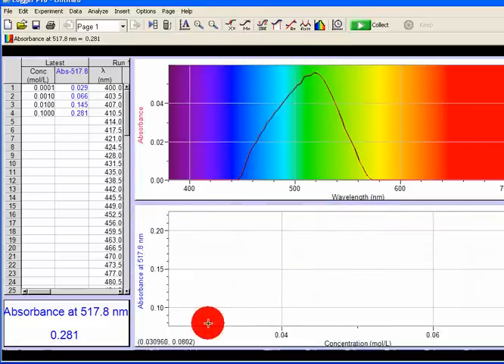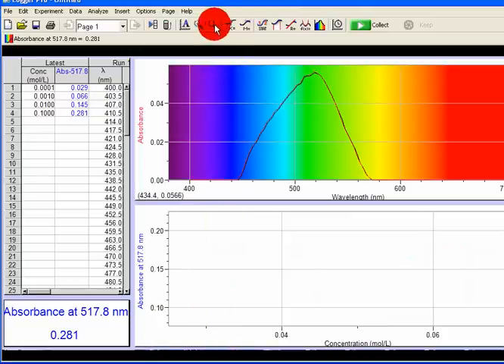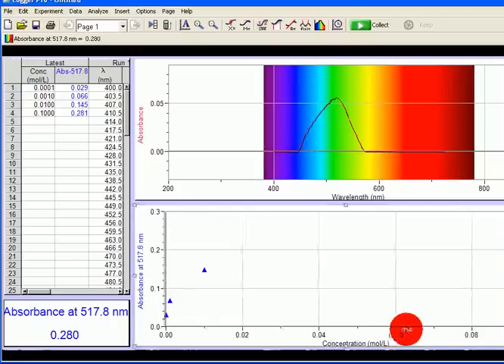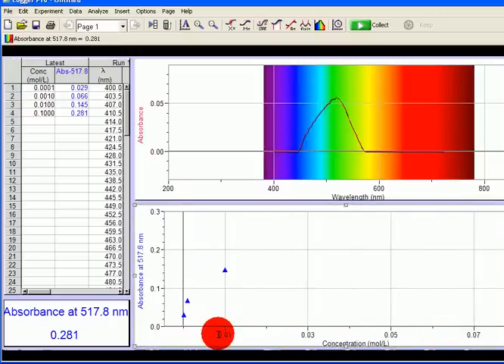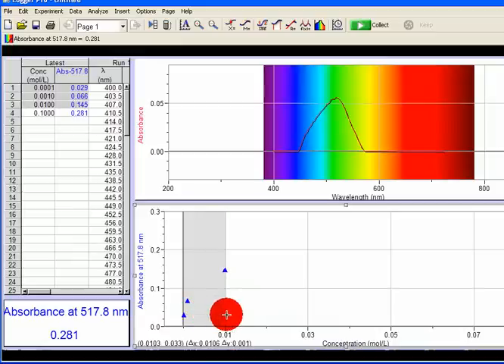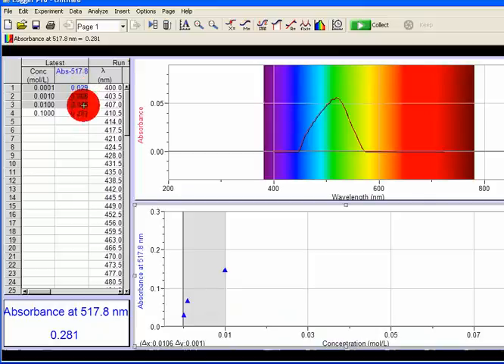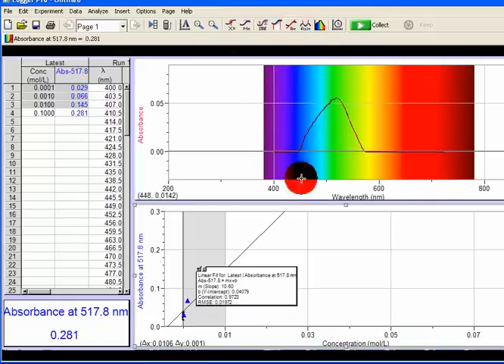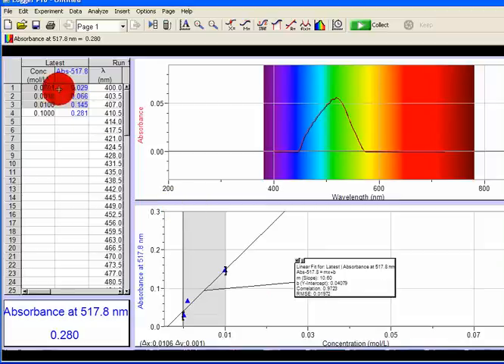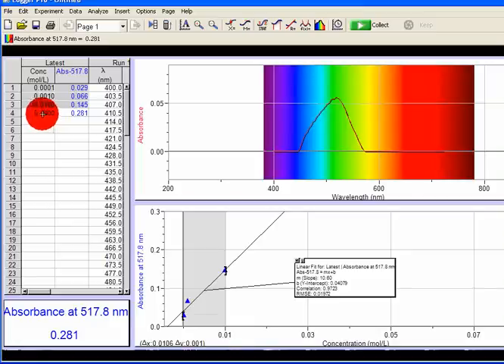I'm going to select my interval and adjust the range. I'm going to select the first three concentrations — one, two, three — and take this regression. This is my linear fit with an intercept of 0.04. What I did was I took the first three concentrations and ignored the last one. Because based on Beer-Lambert's Law, if the solution is highly concentrated it would deviate from Beer-Lambert's Law. So I only take the first three concentrations. This is my line of best fit.